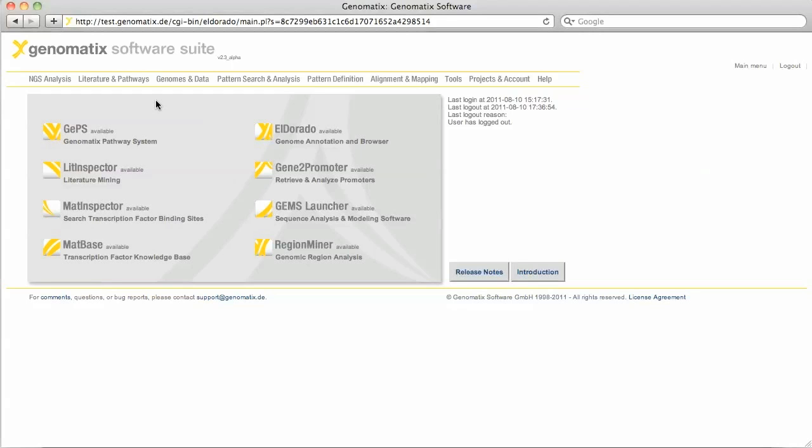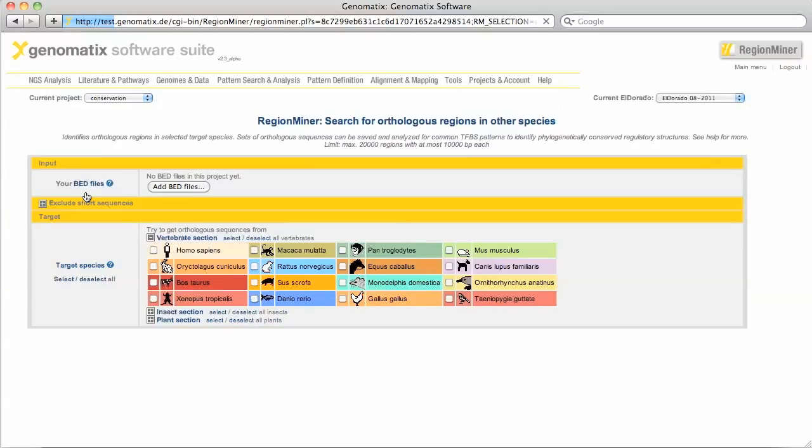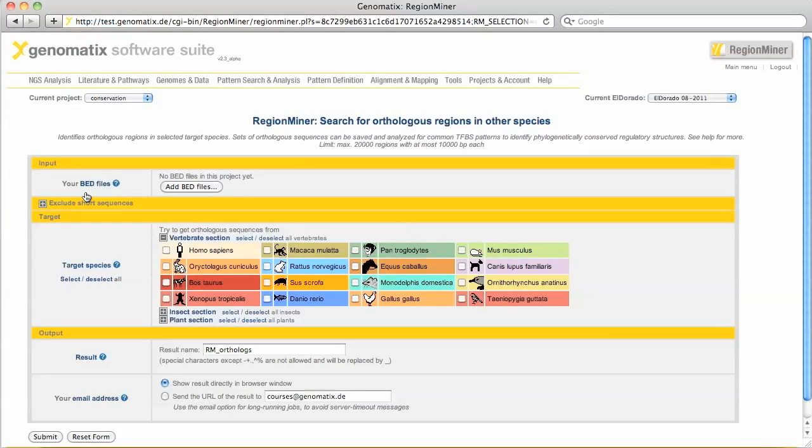For this we will use the program Orthologous Regions in the NGS analysis menu. It uses synteny and sequence similarity to identify orthologues of genomic regions that you upload in a BED format file. Then we will search for conserved transcription factor binding site patterns with FrameWorker.